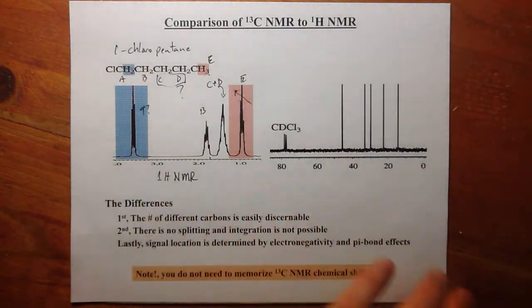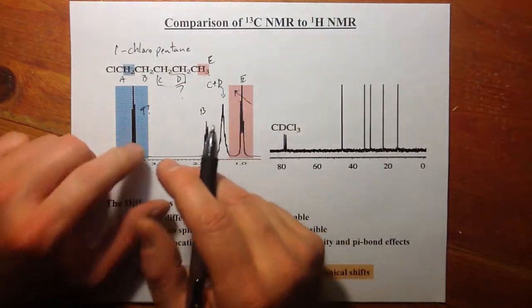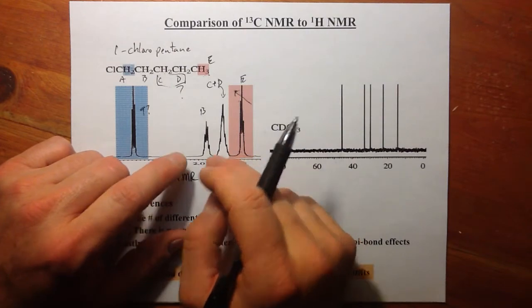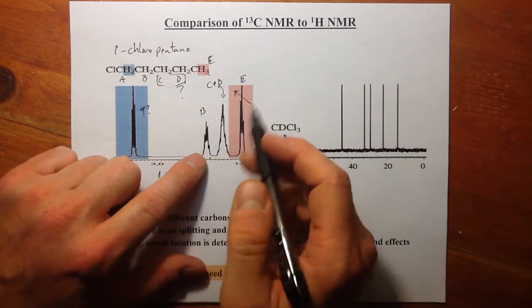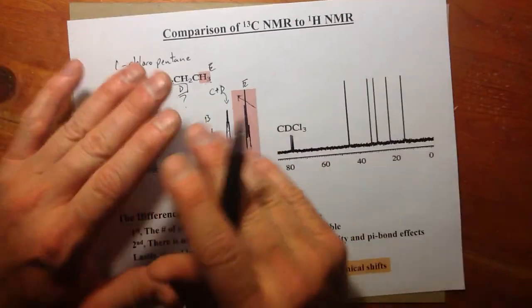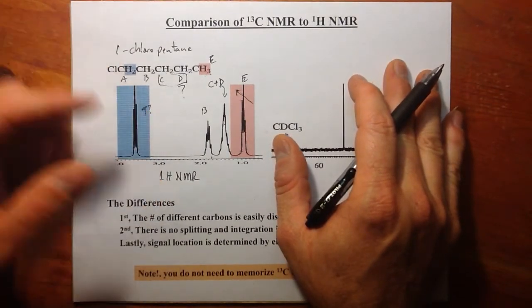We could say that's a problem, because in proton NMR we would like to have all signals resolvable, all non-equivalent protons having their own signal. But this is really two signals overlapping, and it's of course hard to look at splitting if two signals are on top of each other, so you want to separate them all. Well, that can't be done sometimes with NMR, and you can say, well, I'll just get a bigger magnet.